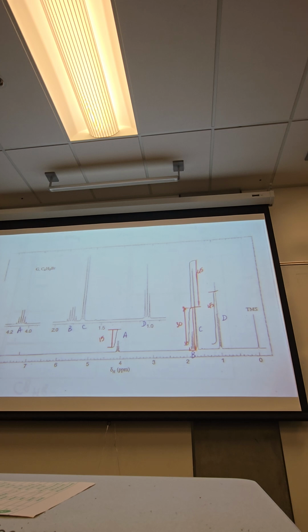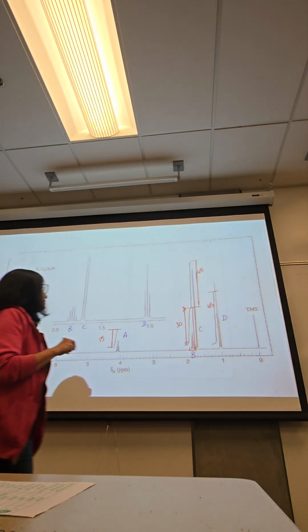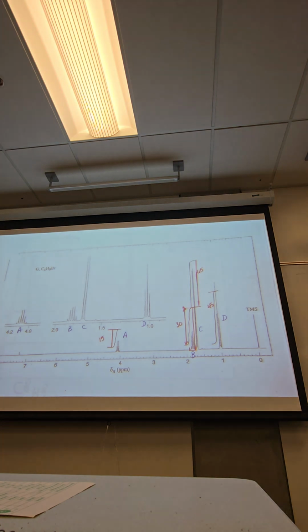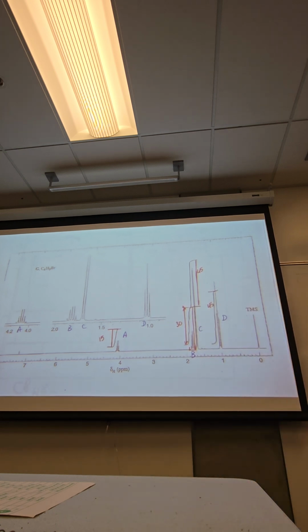But you can measure in centimeters, you can measure in inches, it doesn't matter, because integration is a ratio, so the units will cancel out. Milliliters would be confusing. I was like, oh no, is this related? No, that's it. We are just measuring the distance there. Are we good, everybody, so far?